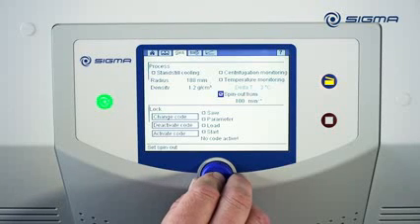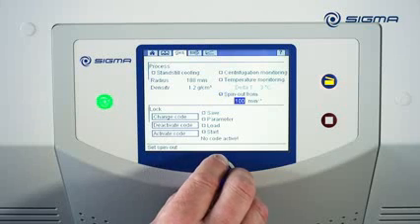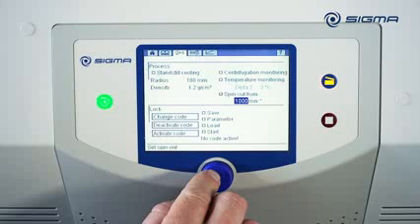If the Spin Out option is enabled, braking is switched off when the rotor speed reaches a defined value during deceleration. The centrifuge then spins down freely. This speed value can be set anywhere from 100 to 1000 RPM.